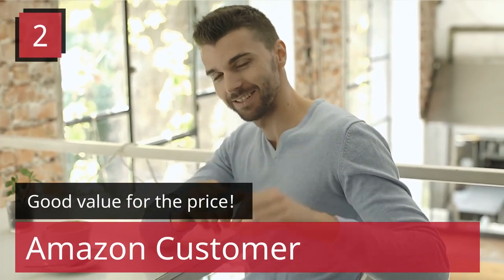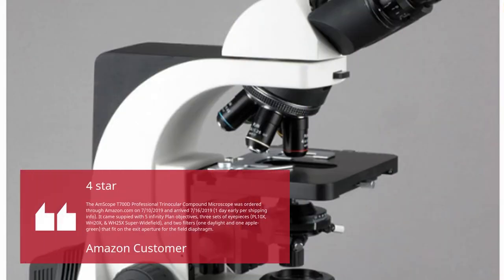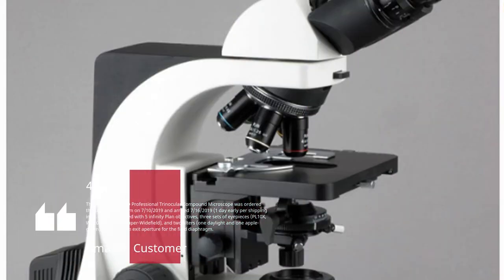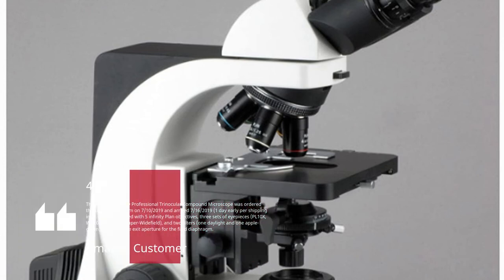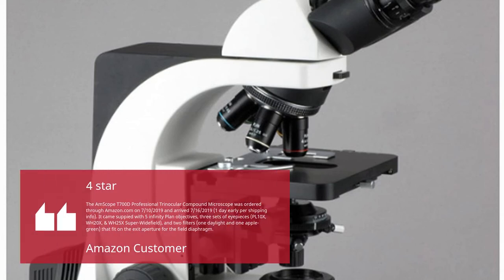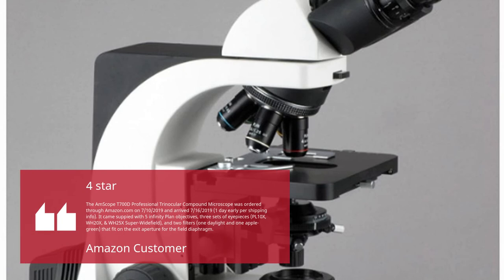Review 2 — Good Value for the Price, 4 Stars, by Amazon Customer: "The Amscope T700D Professional Trinocular Compound Microscope was ordered through Amazon.com on July 10, 2019 and arrived July 16, 2019 — one day early per the shipping info. It came equipped with five infinity plan objectives, three sets of eyepieces (PL-10X, WH-20X, and WH-25X Super Wide Field), and two filters — one daylight and one apple green — that fit on the exit aperture for the field diaphragm."